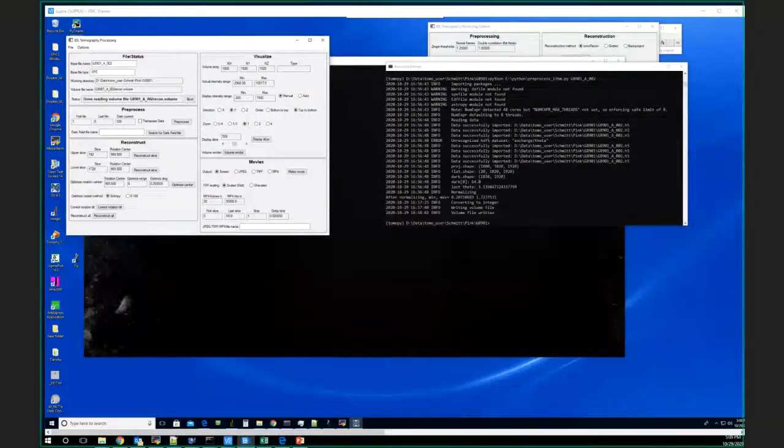Okay. I wouldn't call a crack an artifact. A crack is what we're trying to image, right? But the ring artifacts, certainly. We've collected plenty of data that is probably not analyzable, not necessarily due to the artifacts so much as it wasn't until the user got home that they realized the signal to noise ratio wasn't sufficient to segment it. I would guess that in the world, there are petabytes of unanalyzed CT data.